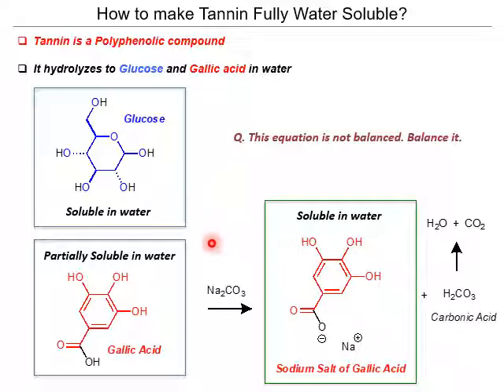The important part here is to be thinking, well, glucose is soluble in water, so I cannot separate caffeine and glucose just through water as a solvent. You can separate cellulose, but not glucose. And even less gallic acid, because it's still partially soluble in water. And by adding that base, by deprotonating this hydroxide group, it is even more soluble in water.